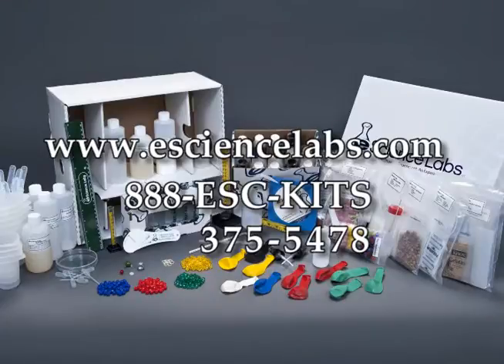Be aware that if you do contact eScience, sometimes the phone will be busy, and sometimes it may take a day or two to get back into contact with the eScience representatives. But they are, for the most part, very good about helping students in a timely fashion. We have had good success with this company, and they're very happy to help you with any questions that you have. Remember that this is your lab manager, which you can also find online. This is your packing list that you should use as soon as possible once you get the kit.